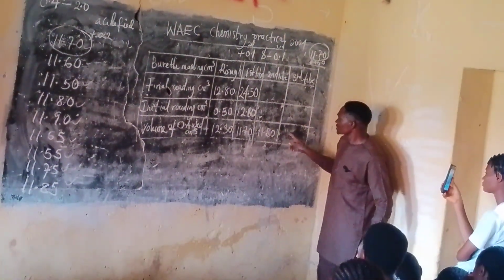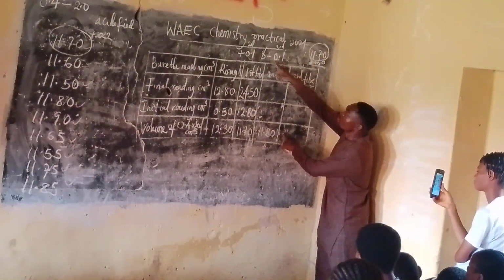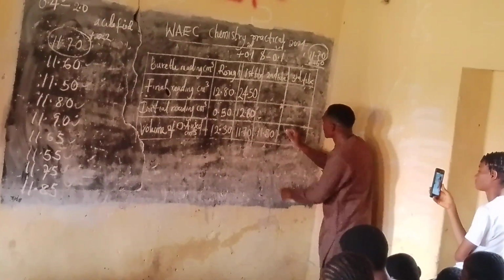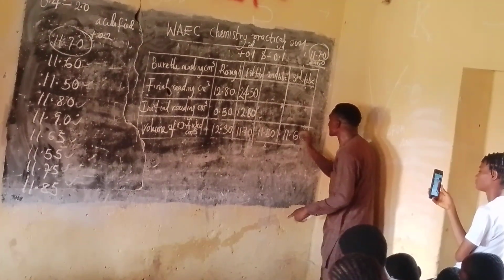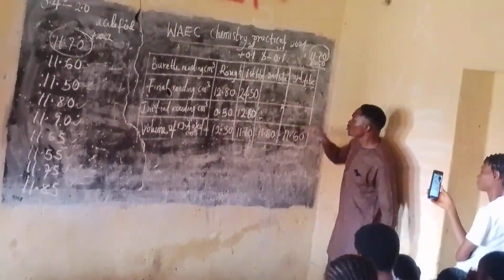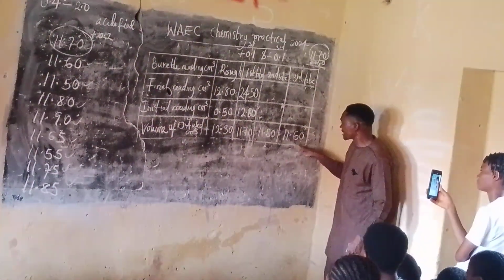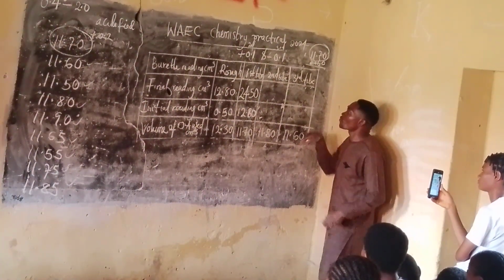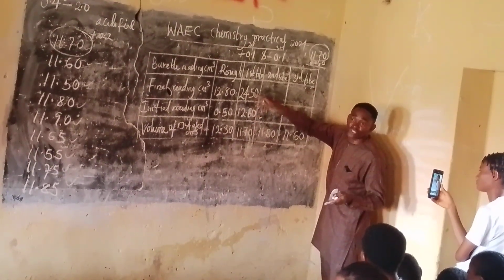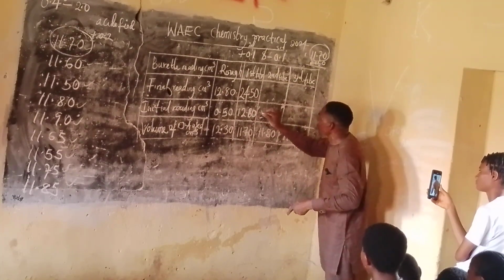Okay. The next one, to create this side, I'm going to remove 0.1 from this. Are you there? So you have 11.60. So you pay attention to what you are giving and work like that. You add 0.1 here and remove 0.1 from this same value, you create this one. Then whatever place, this one is up to half now. I may decide not to start here again. I may decide to refill my burette. Let's say I refill it to 2.0.